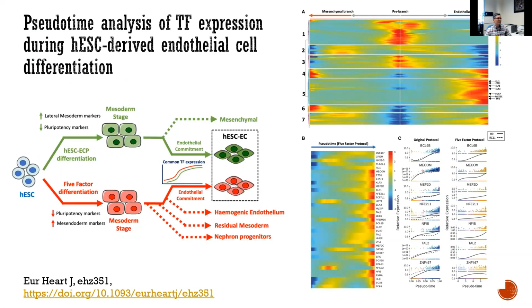That's still from the same paper, and it looks like they identified two separate trajectories, and then different factors change, and at the end they converge into the same cell type. They identify the two different paths from a stem cell to this more developed stage of cells.